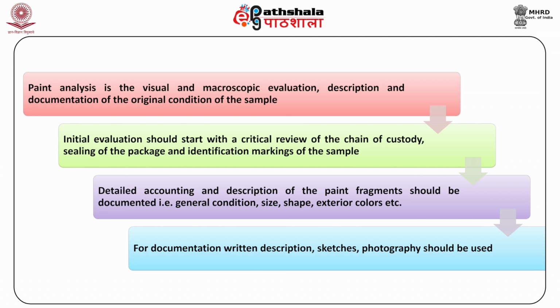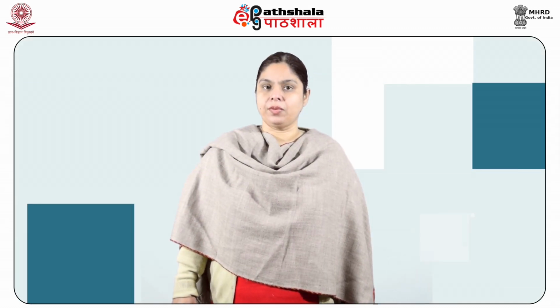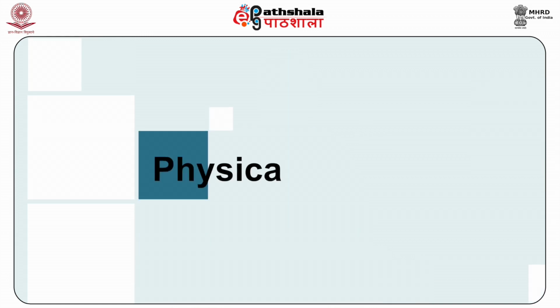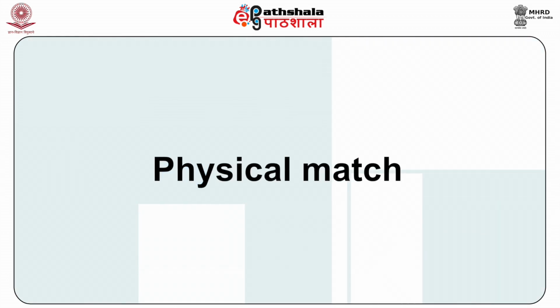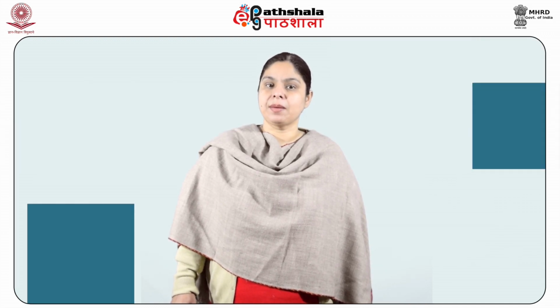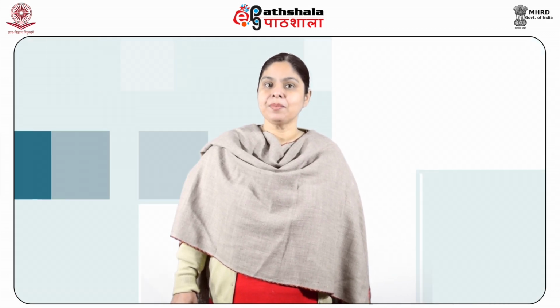That is, in general, the size, the shape, the general condition, the exterior colors, etc., which is examined using a stereo microscope, should be documented. Now, some of the techniques used for a detailed paint analysis are as follows. The first thing is the physical match. The physical match is the most conclusive type of examination that a forensic investigator can perform on paint samples.